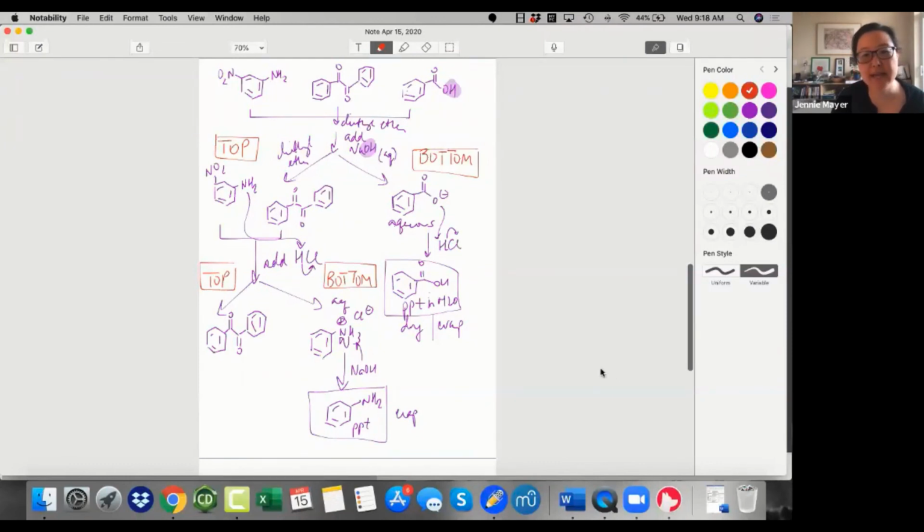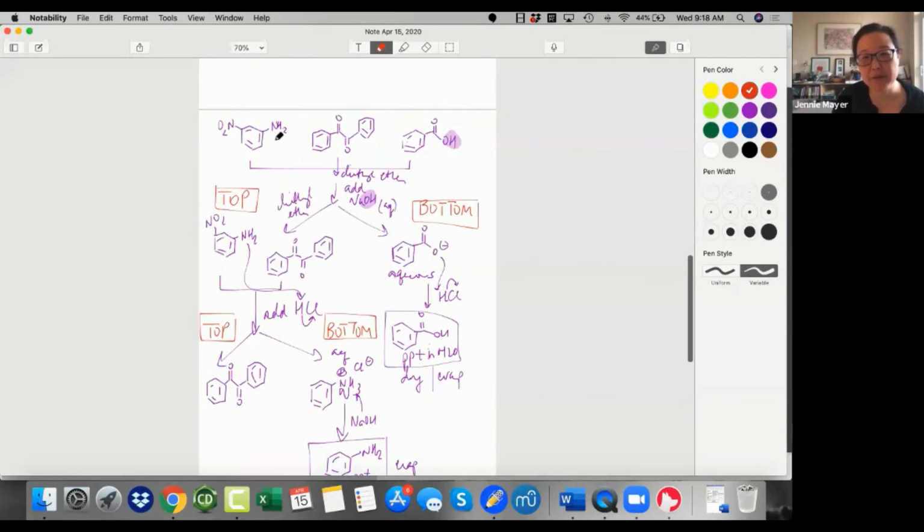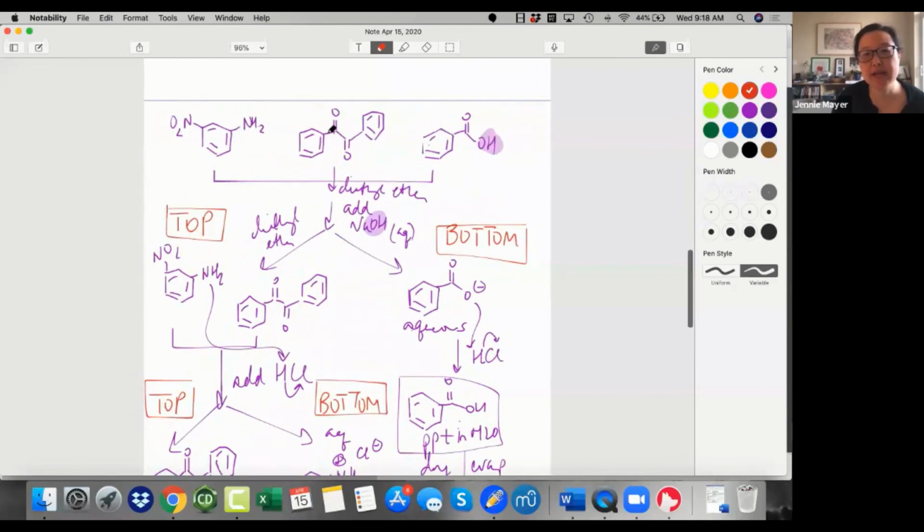So what they're saying is you don't even know if diethyl ether will be the best solvent to dissolve all of these, so you have to test it out first. Maybe you start by saying, okay, try testing these out in diethyl ether. If that doesn't dissolve everything very well, then try what? Maybe methylene chloride. So you can build into your procedure some of that uncertainty and what you would do.